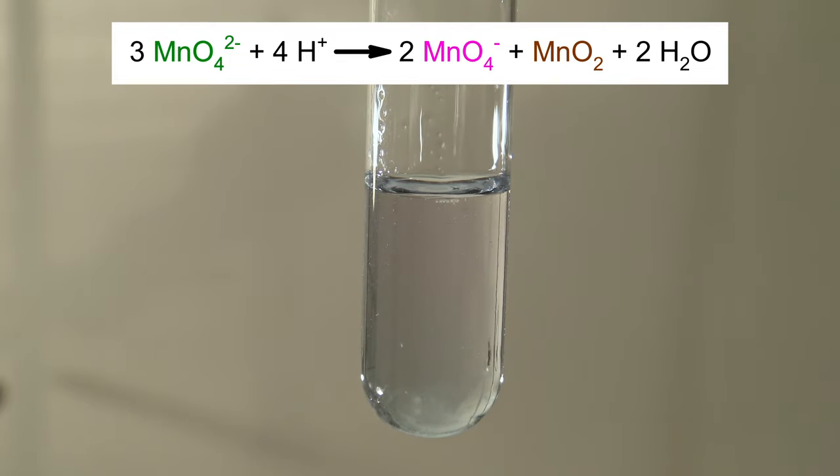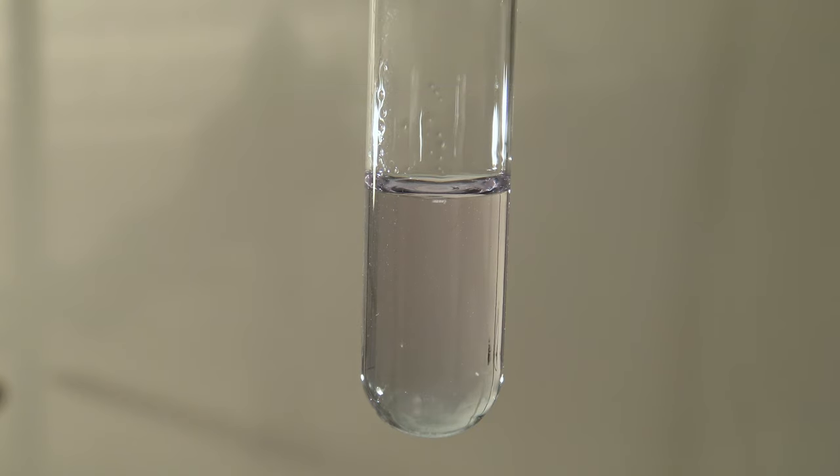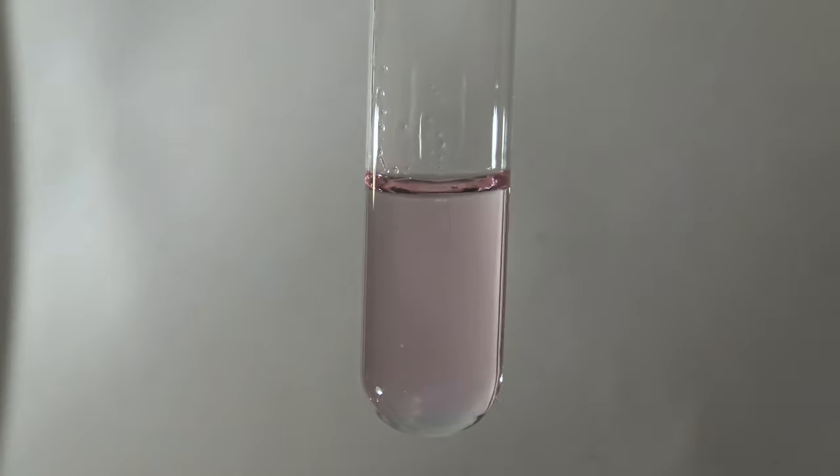The brown manganese dioxide is practically invisible at these low concentrations. Very dilute sulfuric acid could also be used here, but when too much acid is added, the permanganate is destroyed. This can't happen when using the bicarbonate.